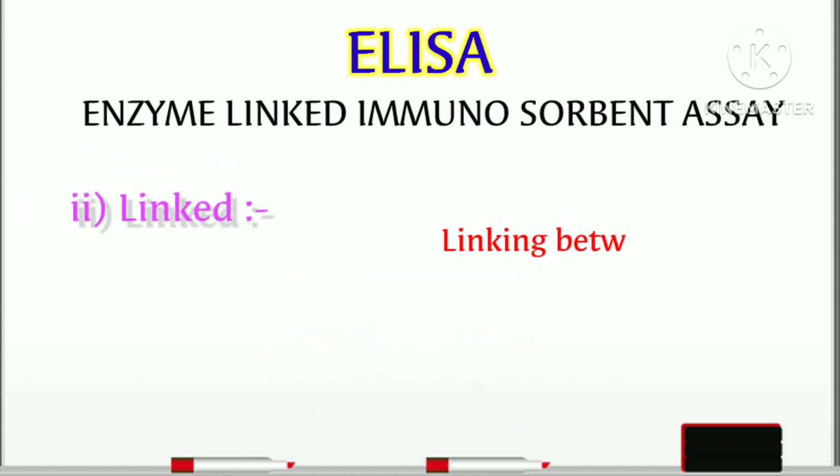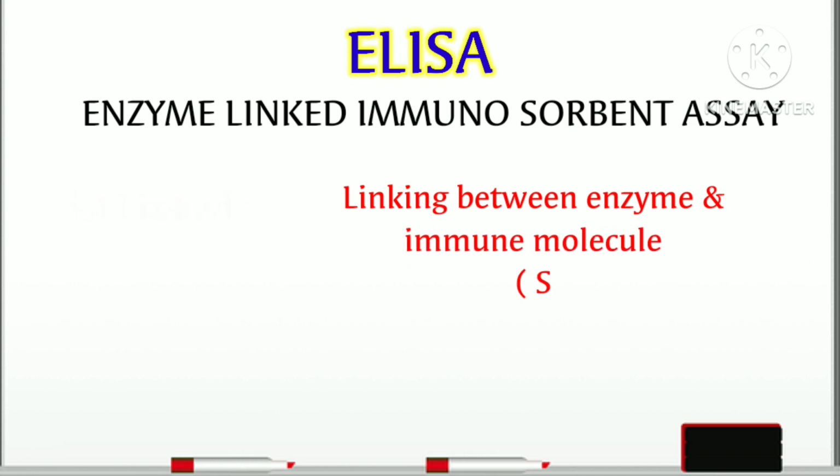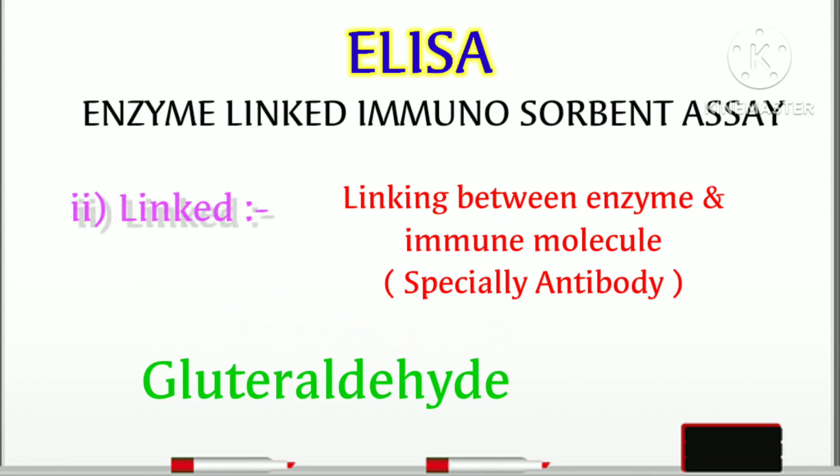Linked. Linked means linking substance, linking between enzyme and immune reagent. Glutaraldehyde is the linking substance, mainly the linking substance in ELISA.